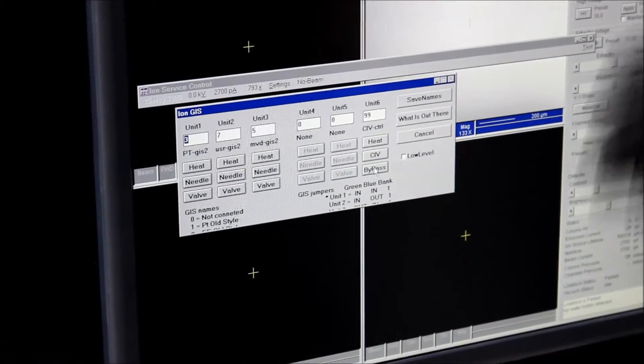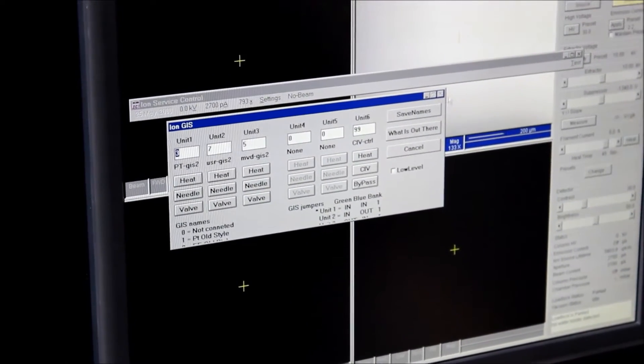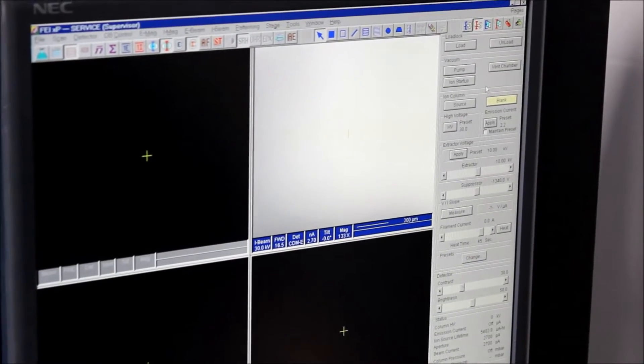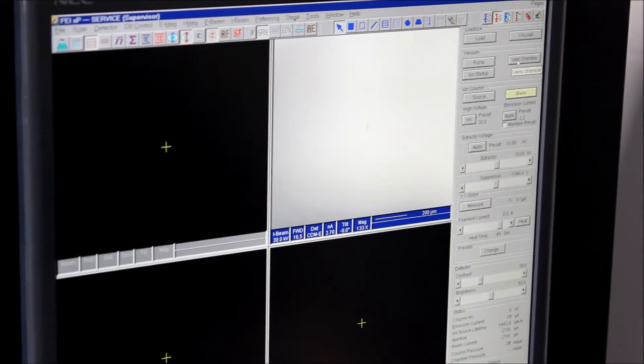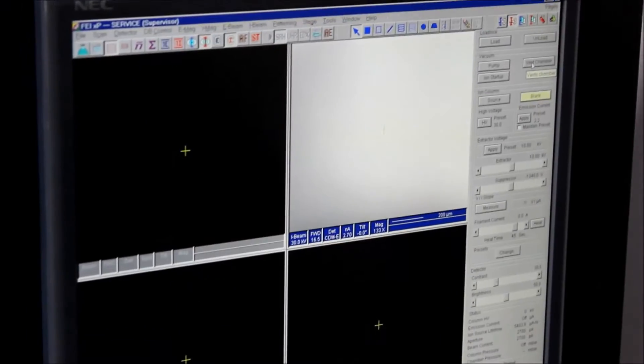That bypass button will open up the bypass valve on the ion column, so when we vent the chamber it vents the ion column as well. We've already done this so it won't do anything, but you can go ahead and click that. Now that all that's done, you can go ahead and vent the chamber, and when the chamber vents the ion column will also vent.